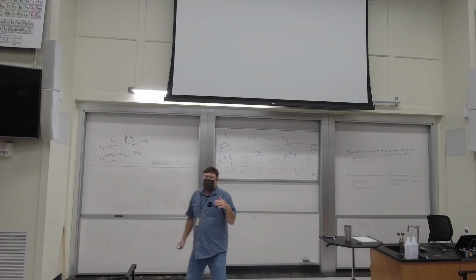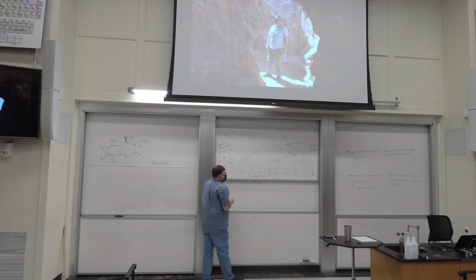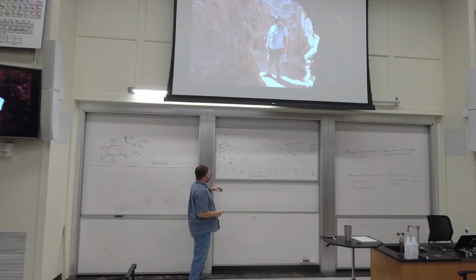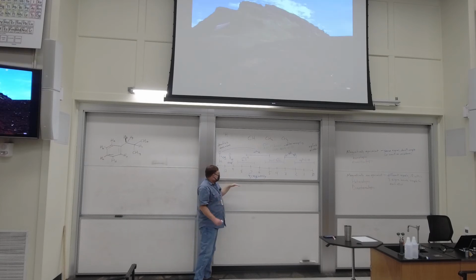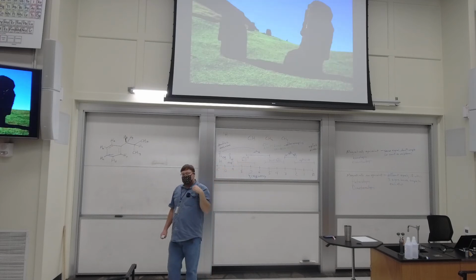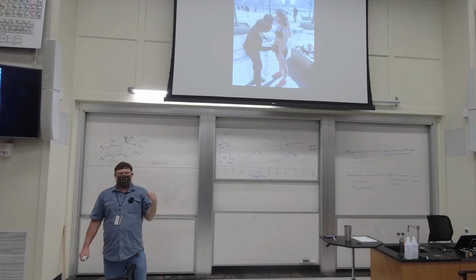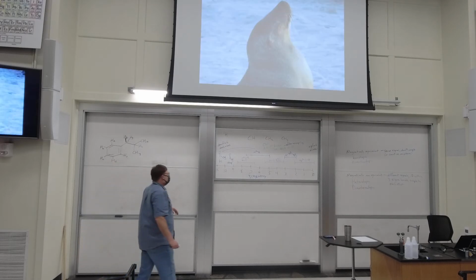Okay. So chemical shift is basically just frequency put into an easier to use axis. Good, there I am in Chile. All right, so the more electron density that's pulled away from the H, the farther to the left it appears. But it's not quite as easy as memorizing that. You've got a region in here for aromatic protons. I want to emphasize this is a 6-membered ring with 3 double bonds in it. It's not just a 6-membered ring. 6-membered rings aren't aromatic. Benzenes are aromatic. 6-membered ring with 3 double bonds.